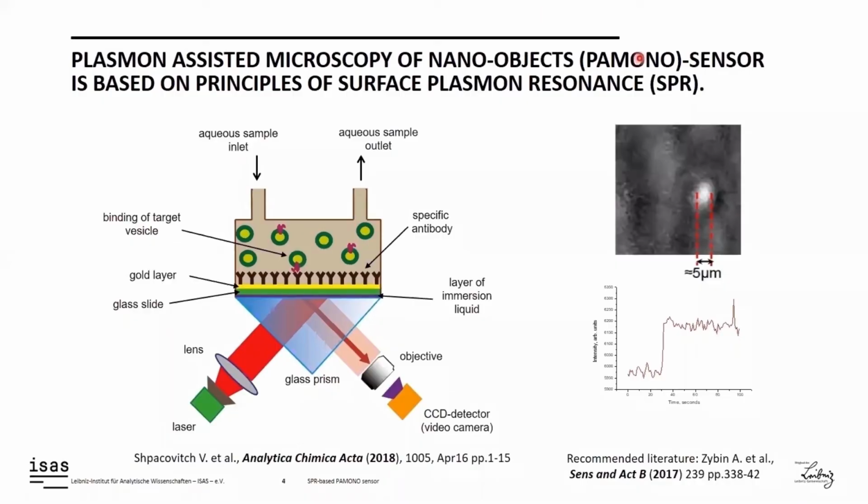On the right panel of this slide, you may see a typical image of the binding signal after binding of a biological or non-biological nanoparticle to the sensor surface.